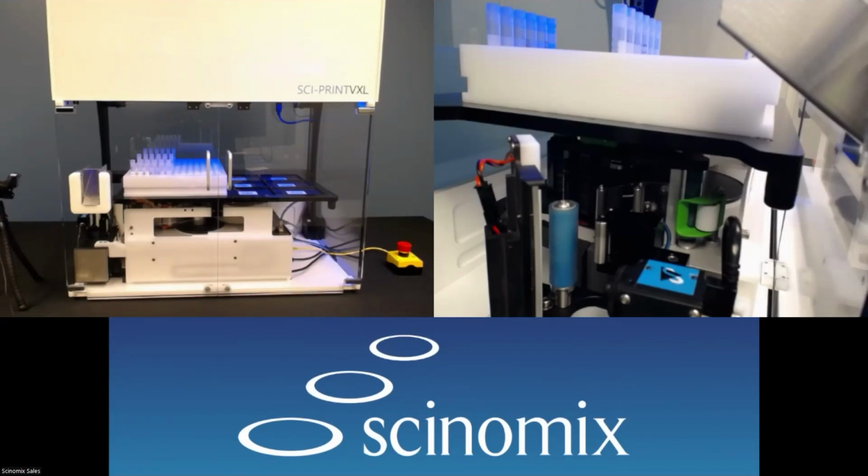So anyways, as you can see, there's a couple differences specifically around the roller. So we have an LED light that illuminates the tube for a clear image. And then we have the camera, which is essentially taking small images and stitching them together as the tube rolls to basically generate a flat pattern of what is on that tube.